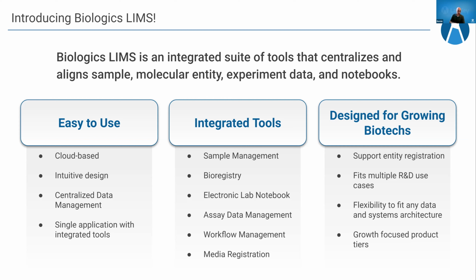And then lastly on this slide is data centralization. While centralization of data from disparate systems is in and of itself one of the most potent improvements to collaboration, there is quite a bit more value here. When the expectation is set that your clean data will reside in one system, trust in that data is going to improve. Tracking or auditing of that data becomes realistic, and the ability to troubleshoot and discuss problems with those involved becomes simpler.